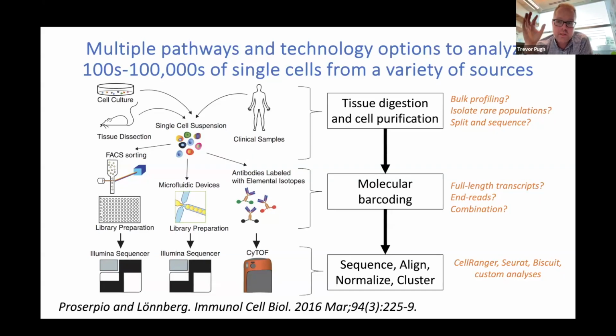Are those cells viable? Are they coming through your flow cytometer, or however you're isolating the cells, in an intact way? And then how do they get sequenced? So really the importance of building in quality control checks to score out the effects of tissue digestion, molecular barcoding, if your method includes it, and the sequencing. Have you sequenced deep enough? Have you saturated your entire sample? Are you detecting every single transcript of your sample, or are you just looking at the top 5 or 10%?